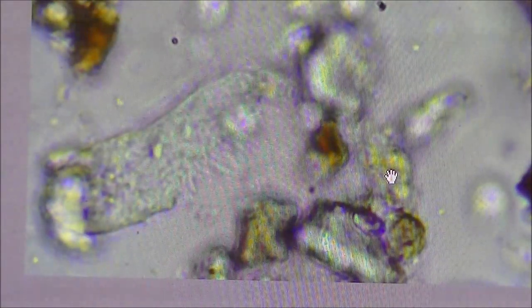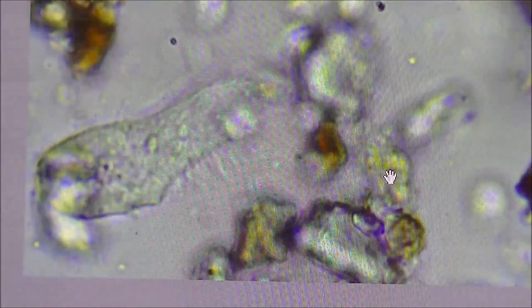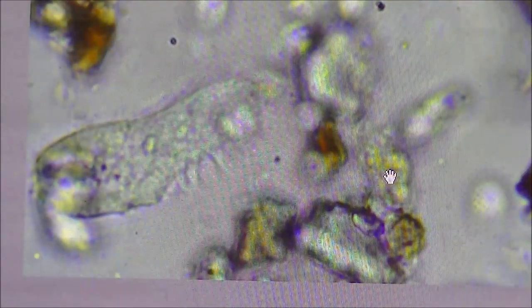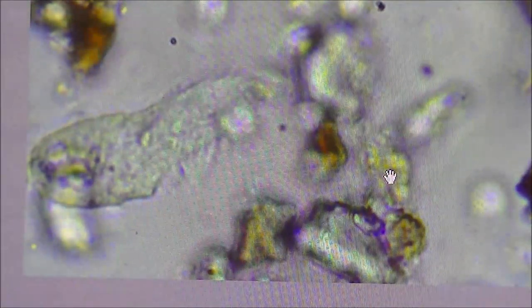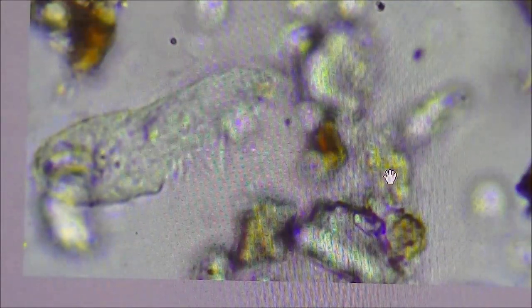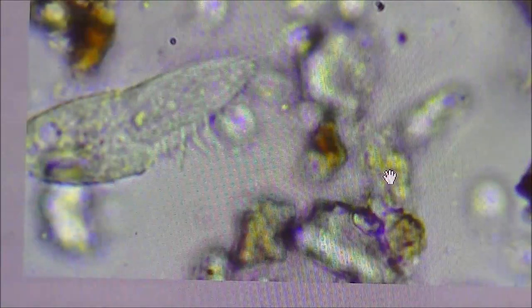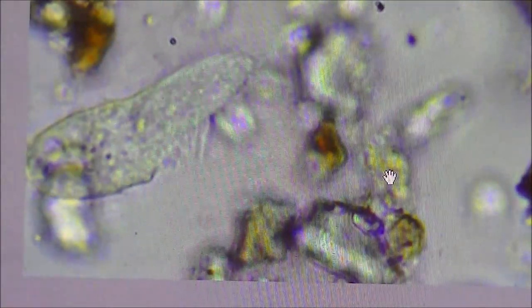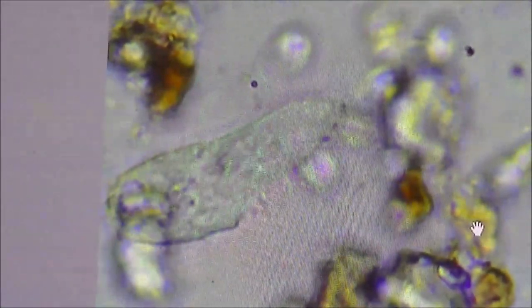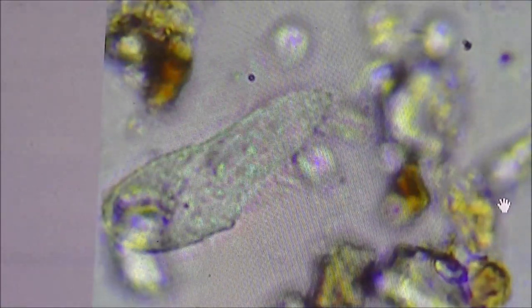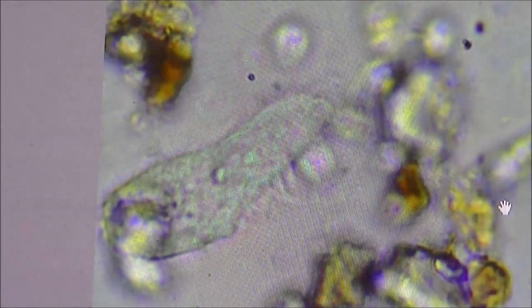Now for this to move from the worm bin to worm castings that you save, I also understand that this will either hibernate or lay eggs if it knows that it's going to die. So you are actually bringing over a new area for that to live in again. When it rehydrates, this will continue to bring back up. Once the bacteria starts growing, it will know this, open up its egg, search out and start eating the bacteria again. That's how the soil food web works and maintains. It is just amazing that we can see this through a microscope and understand that it's constantly searching, always just keeps swimming around.